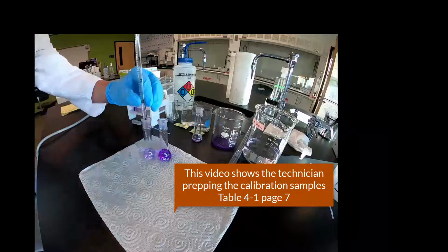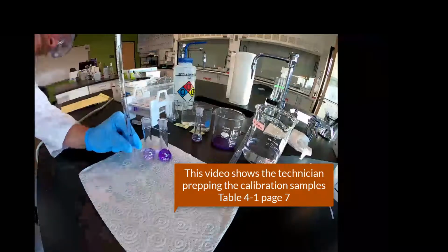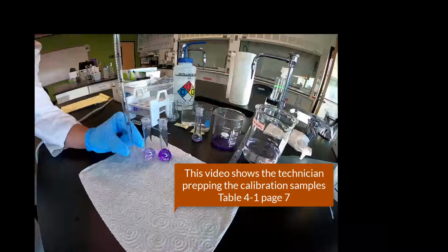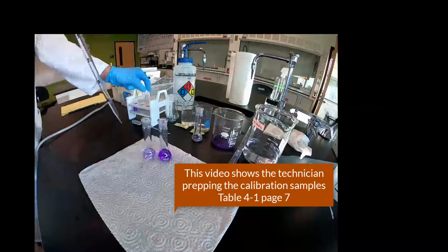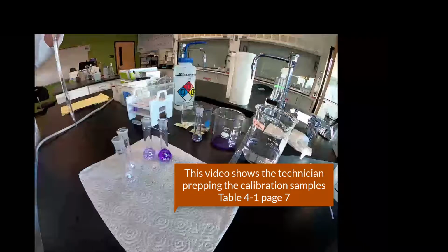Like that. So he's getting his eyes parallel with the sight line. That way you don't get what's called parallax. If you try and view that line from up above it, you'll have a wrong measurement in the height. So that's more good technique.